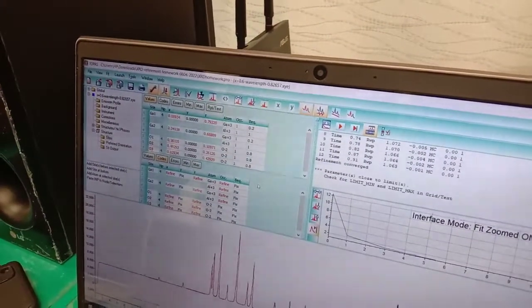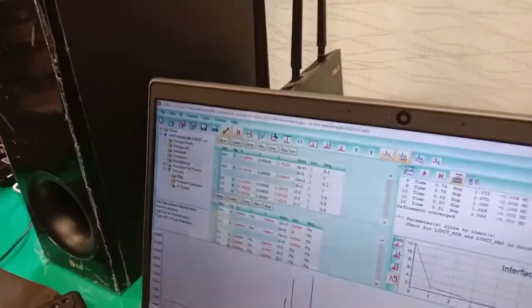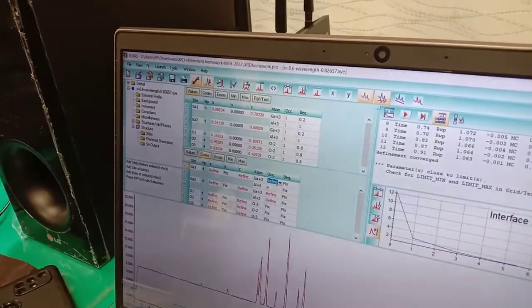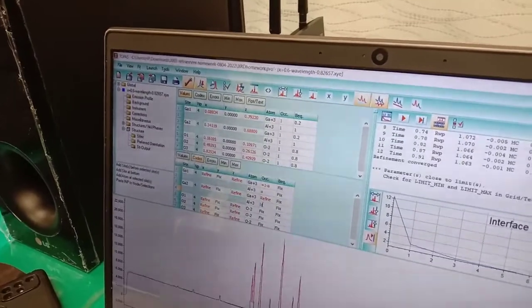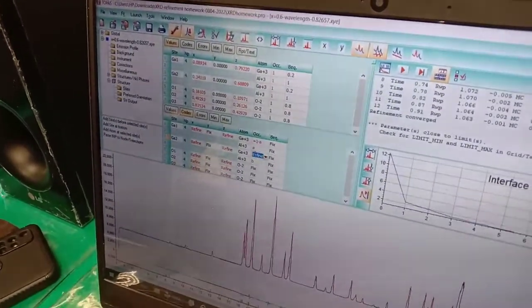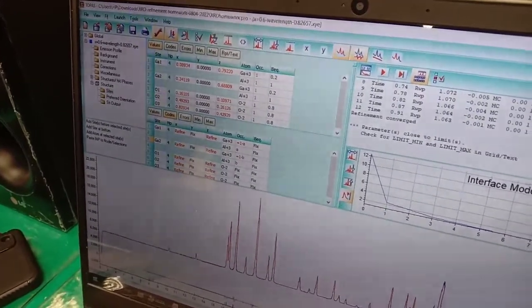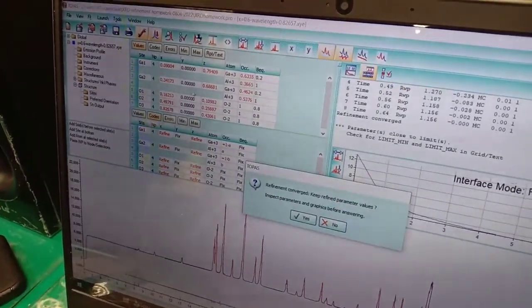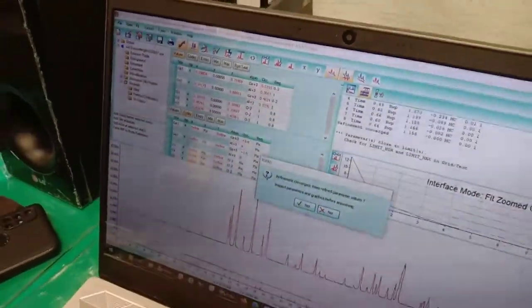So we basically set some kind of equations, like I just say A is equal to 1 minus A, and similarly B is 1 minus B, and I refine. Now you can see it's turned into 1.